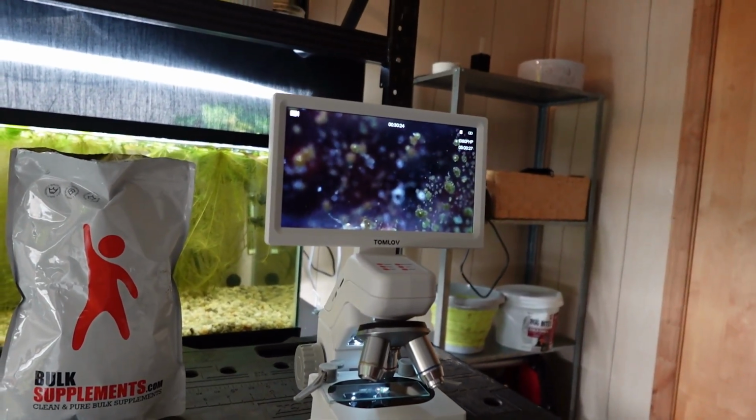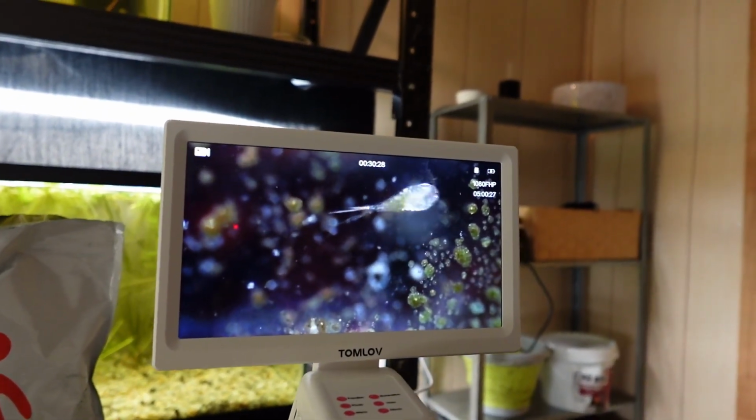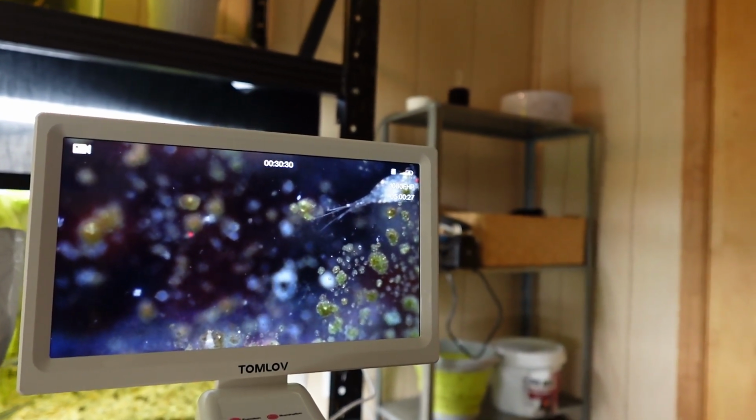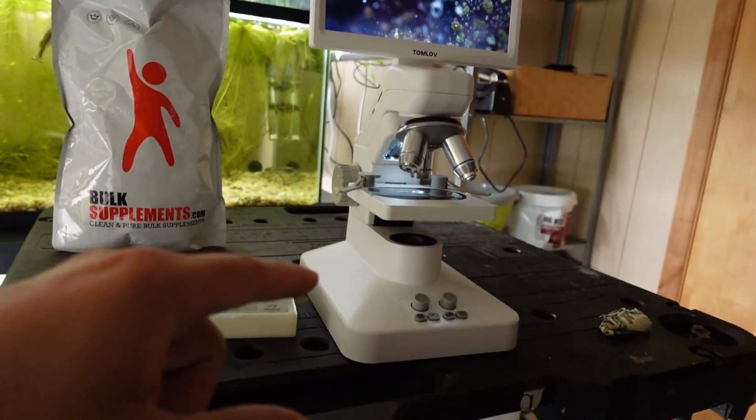I'm gonna play around with it some more because I love seeing these little copepods feed. Look at that one, eating right in front of us. He's eating the spirulina powder. This stuff really works. This microscope is awesome.